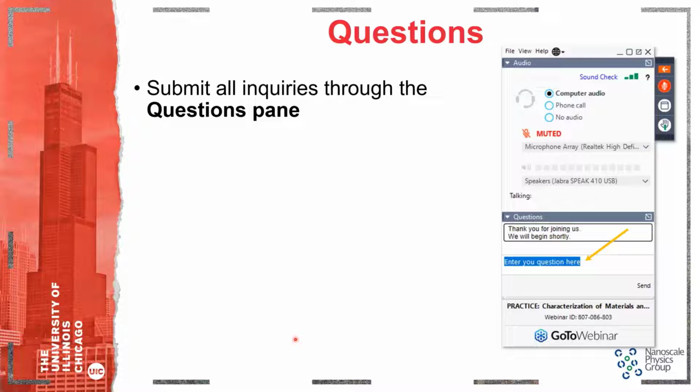I know that in the 4D STEM data analysis, you mentioned using Py4D-STEM and HyperSpy. We had a question about what you used to analyze the nano diffraction patterns. So I'm curious if you could answer that, or maybe just give a little more detail for the audience about how you were analyzing the 4D STEM data.